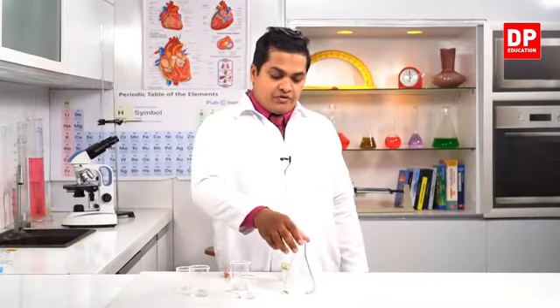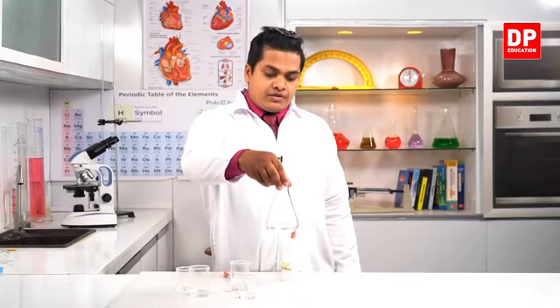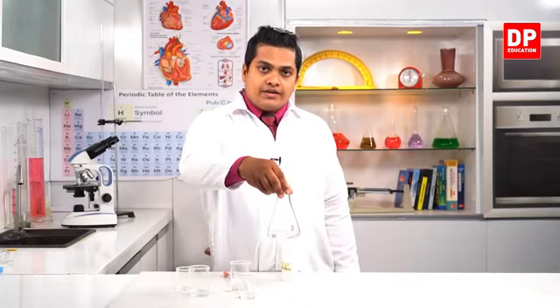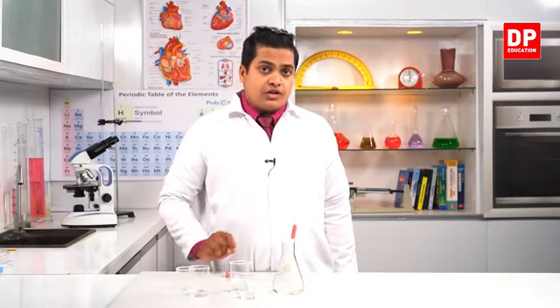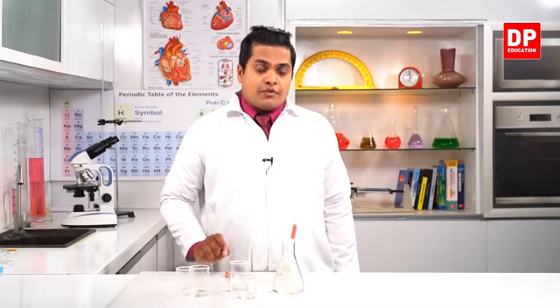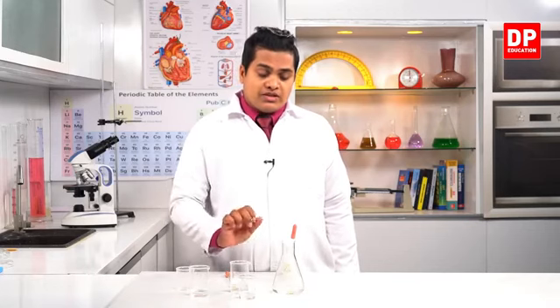Right, my dear children, now you can observe the colorless solution. Now I am going to show that when I add some amount of sodium hydroxide back to this solution once again.